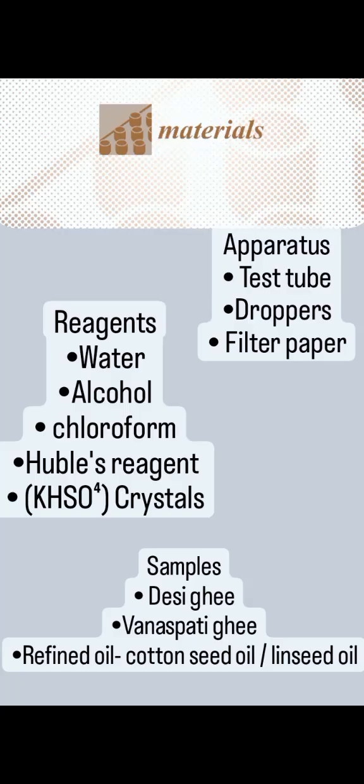Buckle up with the new discussion, which is the laboratory experiment: qualitative and quantitative test for lipids. And these are the following materials. So firstly, we're going to elaborate that the qualitative analysis of lipids helps us determine the presence or absence of lipid depending upon the color change.